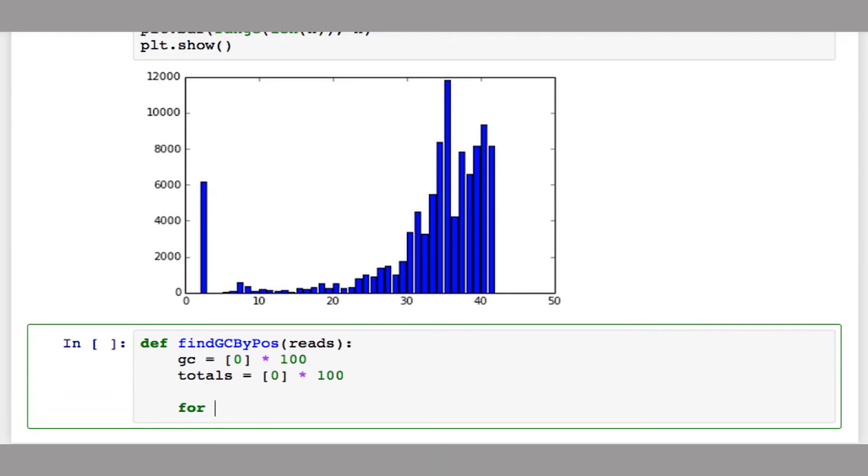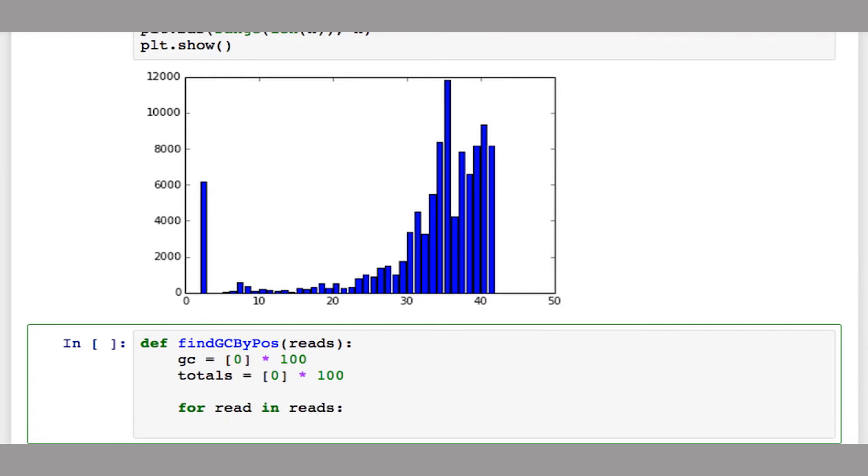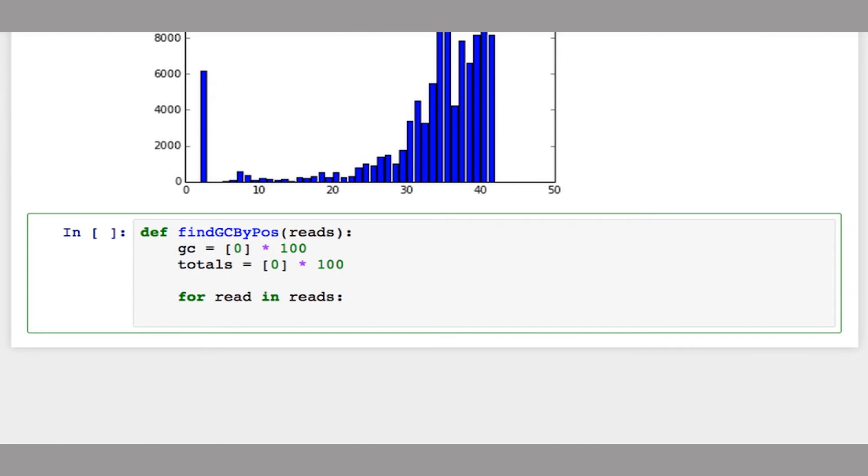Now let's loop through each read in our set of reads. In each read, I'll loop through each base, for each index i in the length of the read.